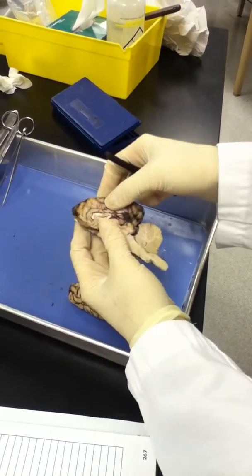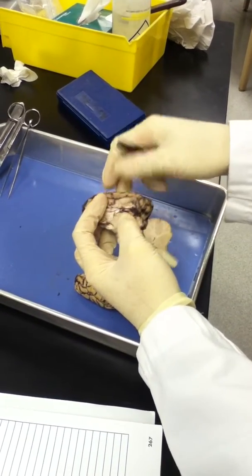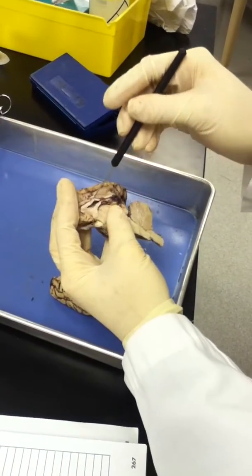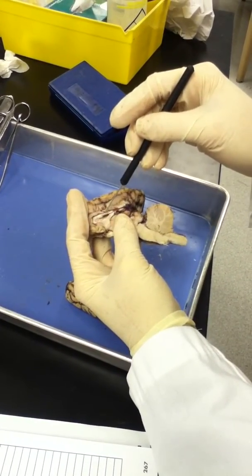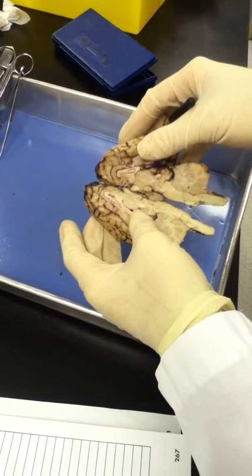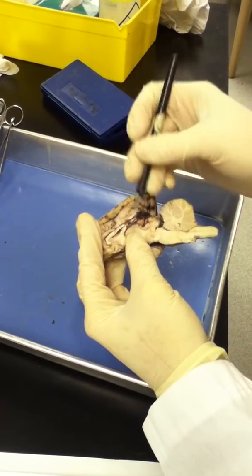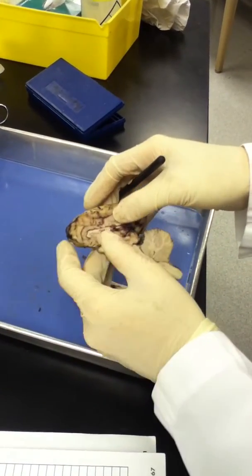Going back into the medial view, the lateral ventricle is seen here. This is where the septum pellucidum would be — this is a piece of it here. I've cut down the middle, and the septum pellucidum covers the central part between the two lateral ventricles. Right down the center I cut it in half, so it's no longer fully visible, but that is a piece of it there.